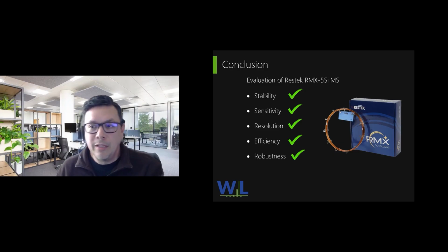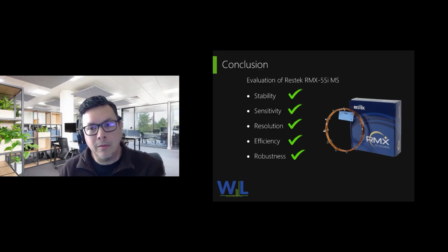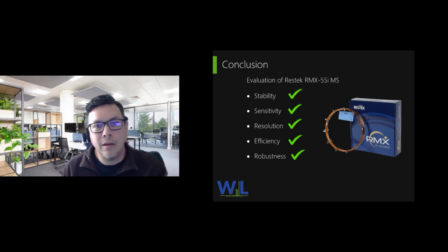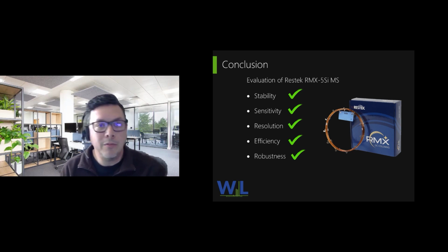In terms of sensitivity, all the peaks of interest were there. My resolution was there. My reporting limit detections were there. I pushed this column a little bit below the limits that I'm looking for, and it produced without any issues.